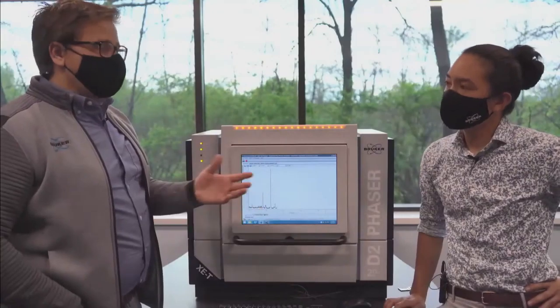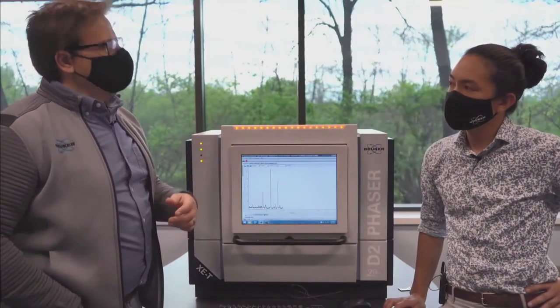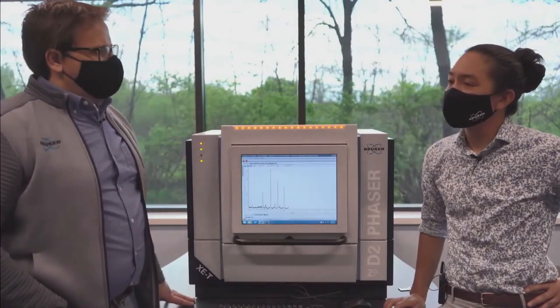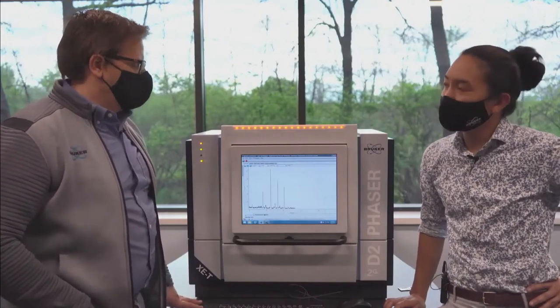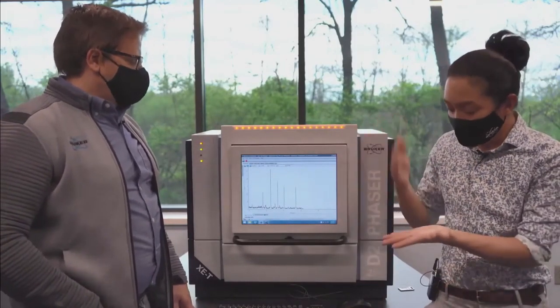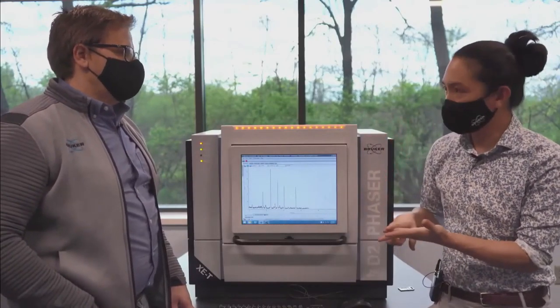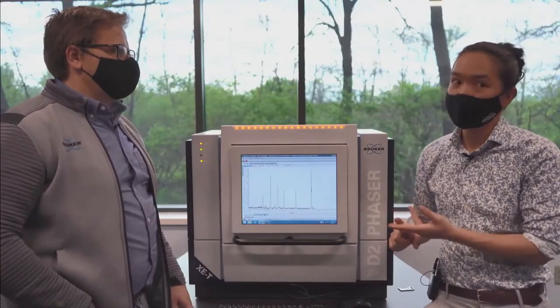Right. And I know that they made a version of it for strip detectors, but that was even more inefficient because of the geometry. Because you basically reduce the size of your detector back to a point detector. So we're talking hours of data collection with a graphite monochromator. Whereas with energy discrimination on a strip detector, you get the best of both worlds. It's all of the energy resolution in terms of removing beta and sample fluorescence, but with the size and speed benefits of a strip detector.